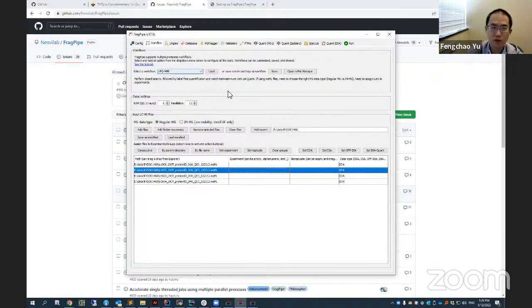Yes. For this, someone asked, is the LFQ MBR workflow for DDA? It is for DDA. It is for DDA for the Orbitrap or Orbitrap with FAIMS or DDA-PASEF. It's supported, actually, all kinds of data I'm aware of. And you don't need to convert it to mzML. You can use a raw file or you can use .d from the DDA-PASEF.